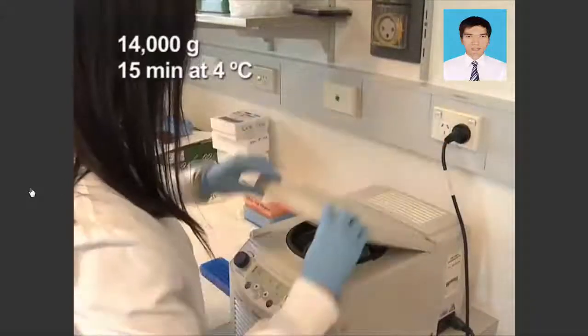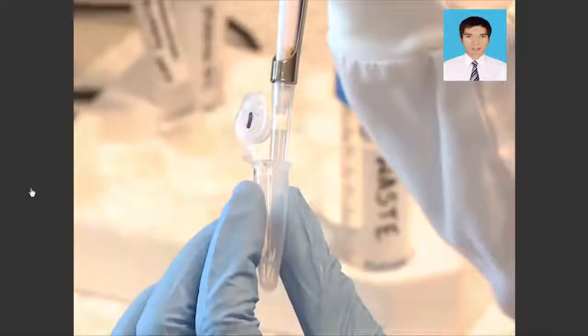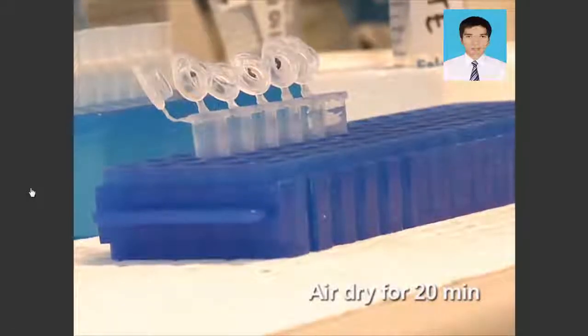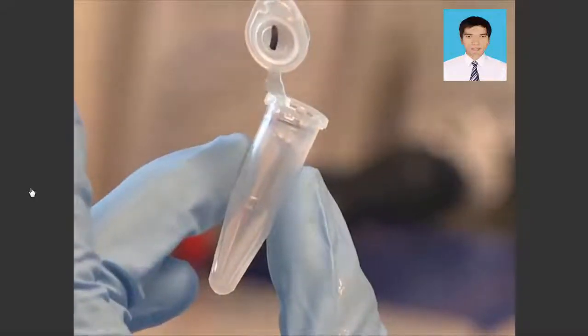Centrifuge at 14,000 G's for 15 minutes at 4 degrees Celsius. Then remove all traces of supernatant and air dry the precipitated DNA for approximately 20 minutes. After air drying, the pellet is almost impossible to see.